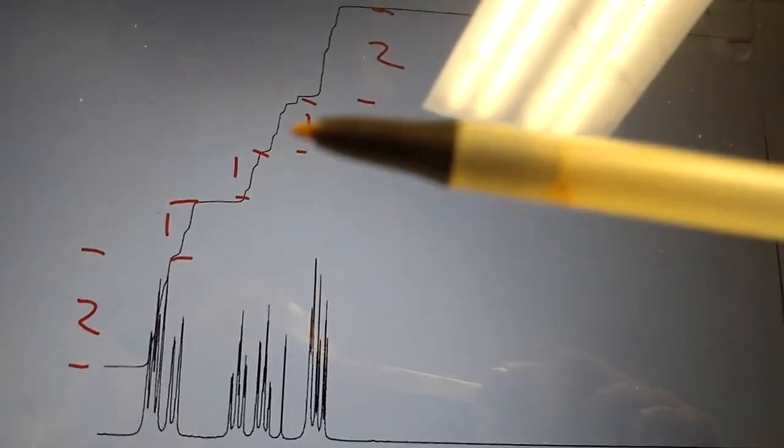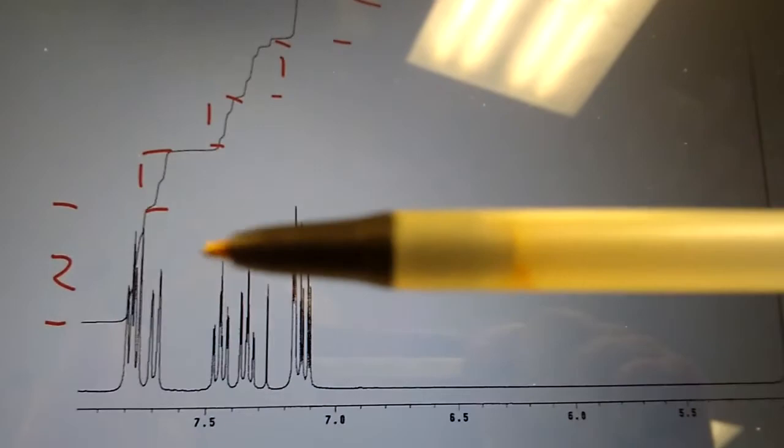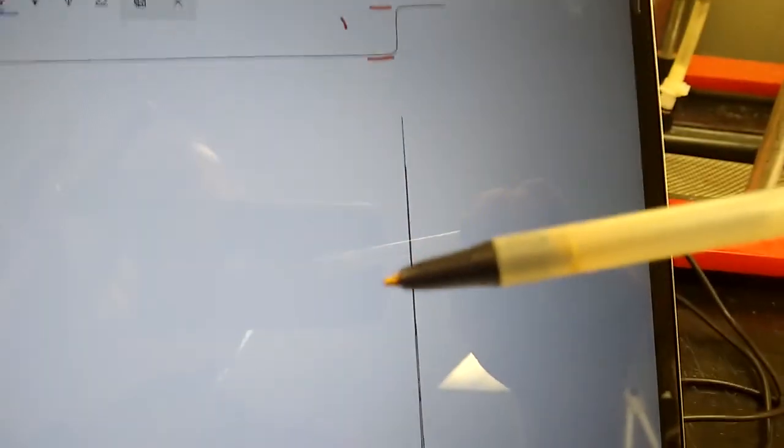If you add these up in the aromatic region, we have two, three, four, five, seven aromatic protons for all of this section here. And then over here you have one, and this is for the OH, the alcohol proton.